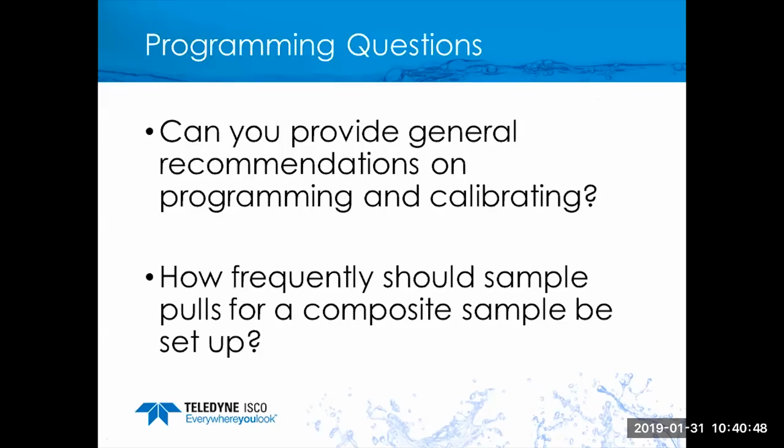Then you also need to make the determination or have the knowledge of, is flow in this particular location I'm sampling from continuous, or is it more periodic in nature? That's going to dictate some of your program selections. This is also very important when you're, again, sticking on the trend of flow-based sampling. You need to know information that pertains to your average daily volume.